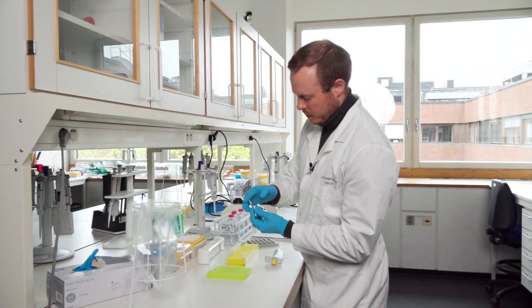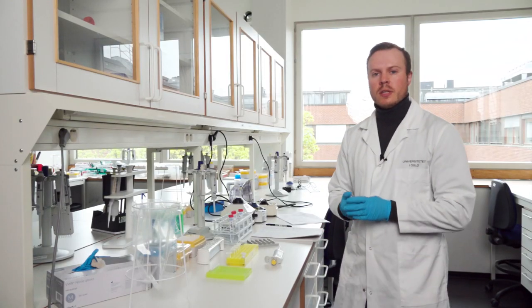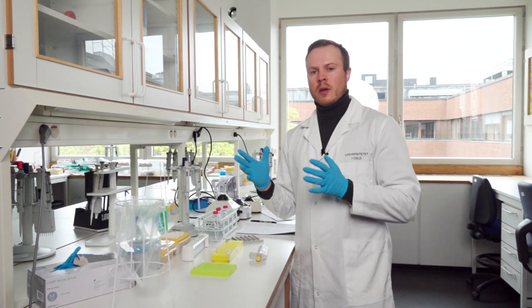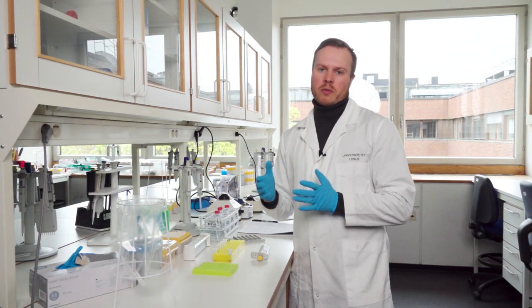Discard the tip. The protocol says the mixture needs to sit and bind for three to five minutes — I normally use five minutes, so now we just wait.